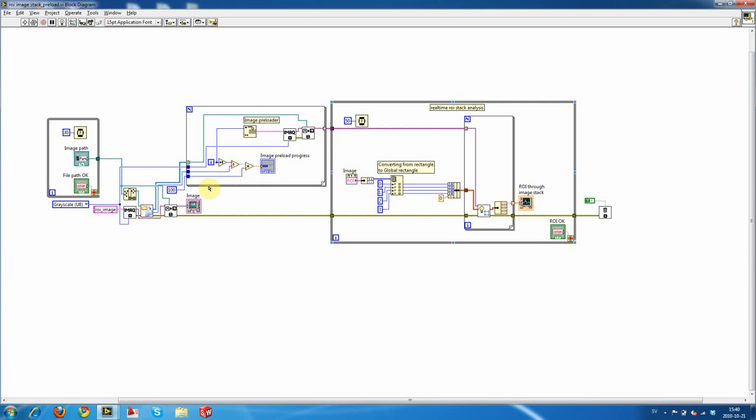Okay, then once we have them all in the memory, we can then read this region of interest, which we made over here. At any point during this section, while you're drawing the region of interest, it will be changing essentially what's inside this value. And then once we hit stop, this loop finishes and it's finished.